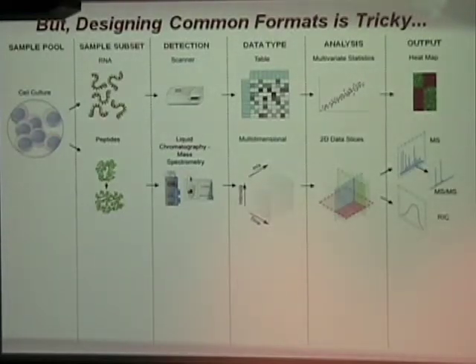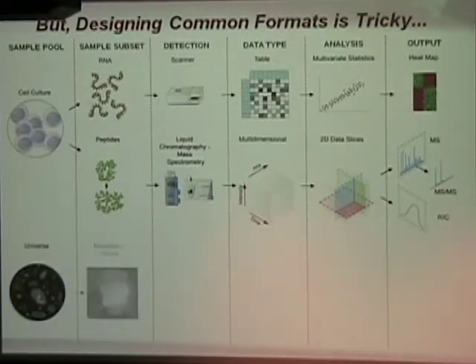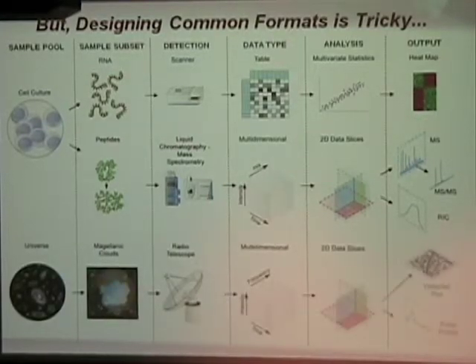And the format choices, which are text-based and XML-based, don't allow you to do this efficiently. So the way we share data hinders our ability to then access it efficiently in this use case mode, when you're actually trying to slice and dice things and do computation. So in that sense, we are actually a lot more analogous to radio astronomy or something, where they have a lot of data.